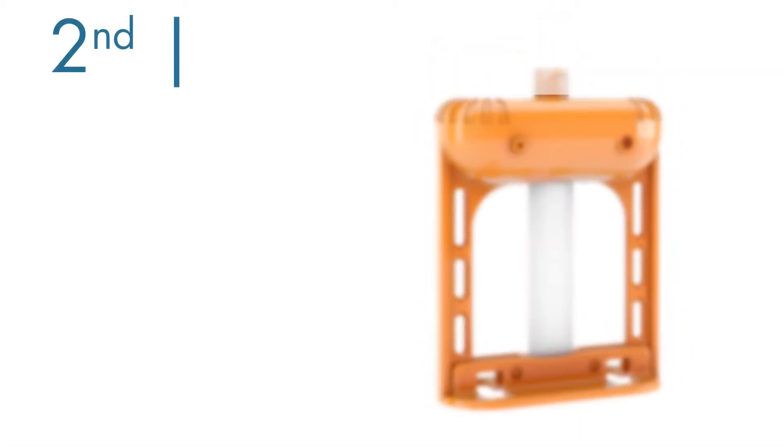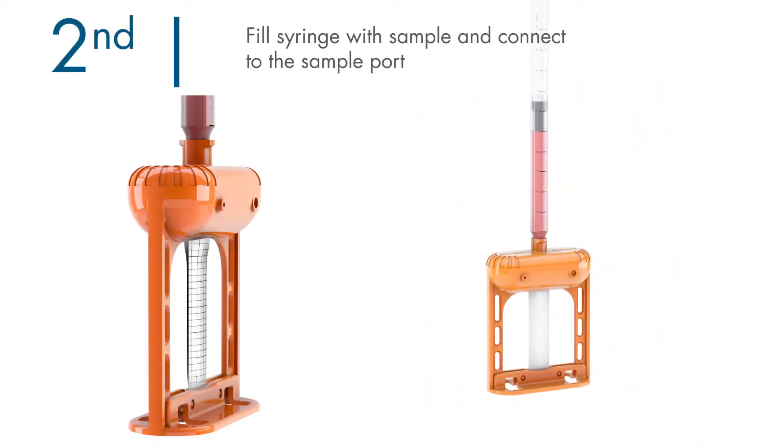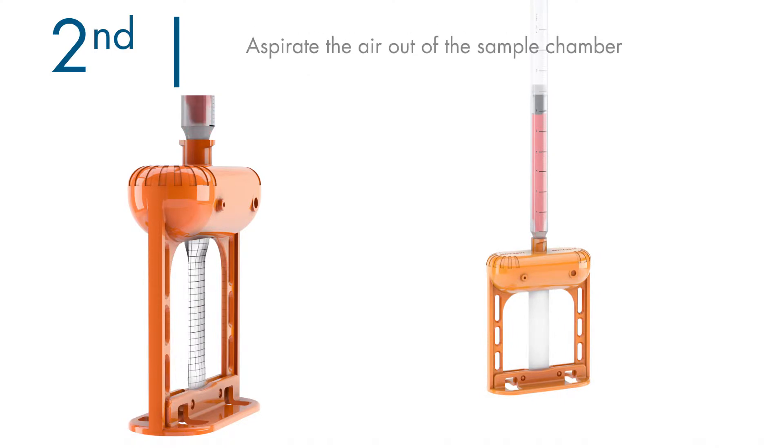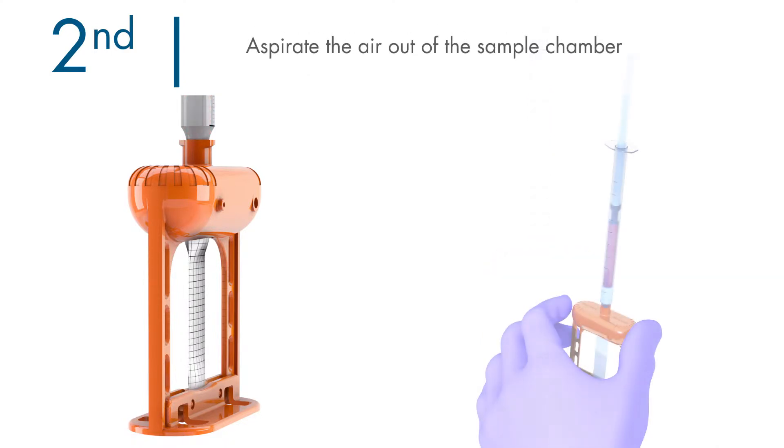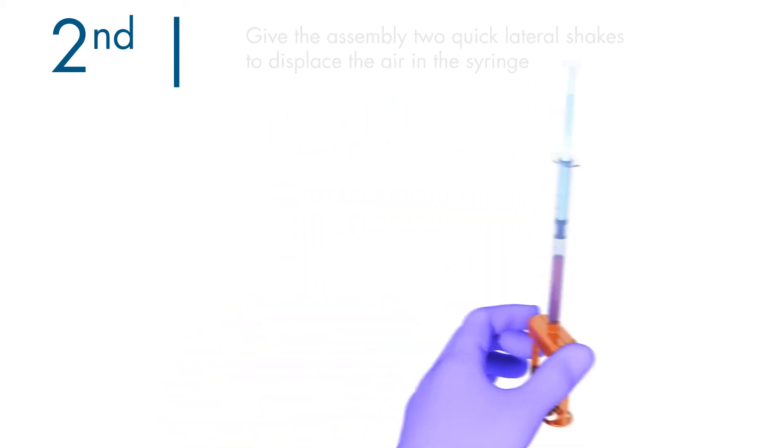Loading the sample is quick and easy. Connect the sample-filled syringe. Aspirate the air out of the sample chamber. Give two quick lateral shakes to displace the air in the syringe, then load the sample into the device.